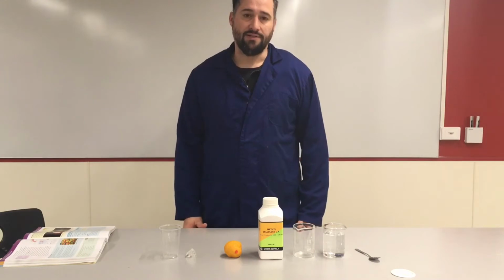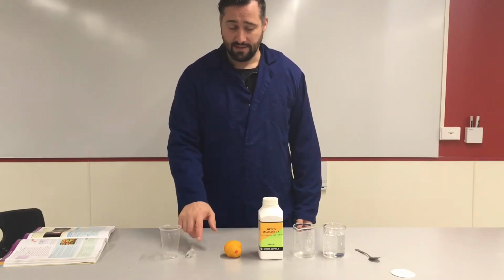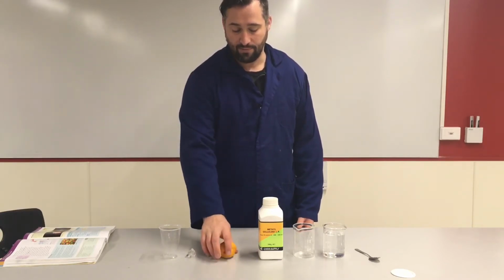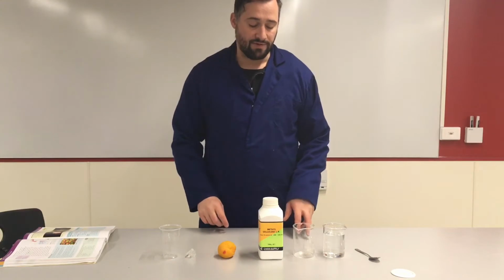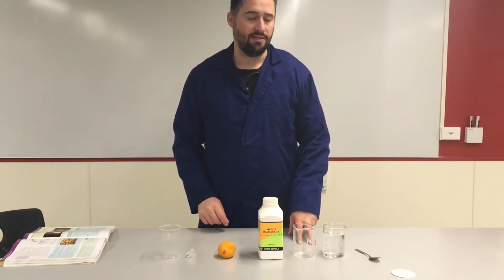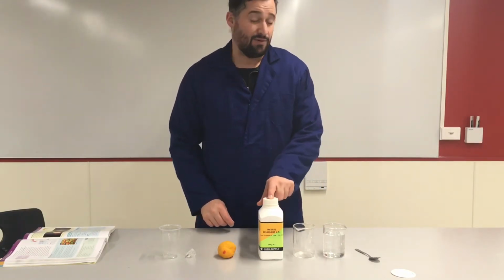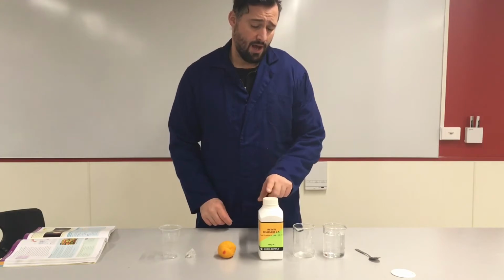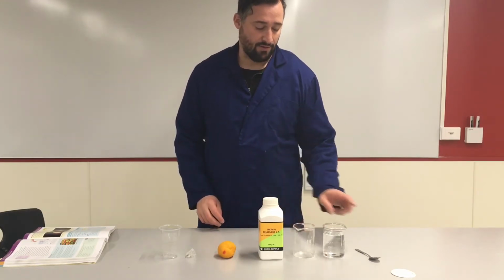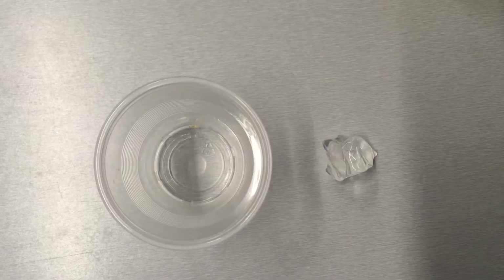So we'll have three different activities we're doing today. The first one will involve a cup and a piece of ice. The second one will involve a piece of Play-Doh, or large ball of it. The third one will involve some, it says hydration powder in your book. What I'm using isn't exactly hydration powder, but it will have the same desired effect. It's called methyl cellulose powder, and I'll have two beakers, one of water, one on its own, empty, and a spoon. Okay, let's get started.